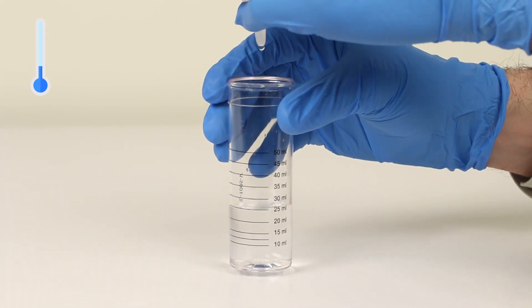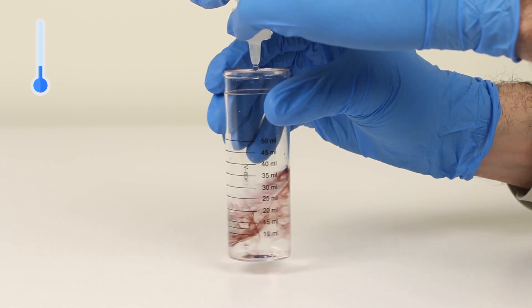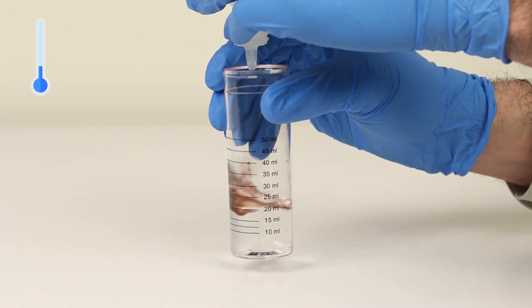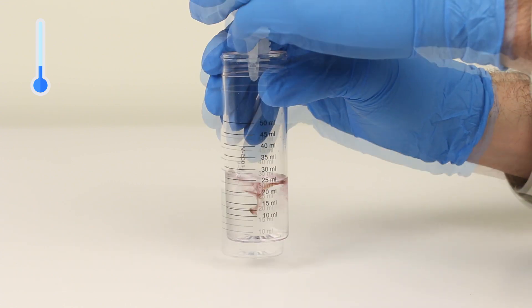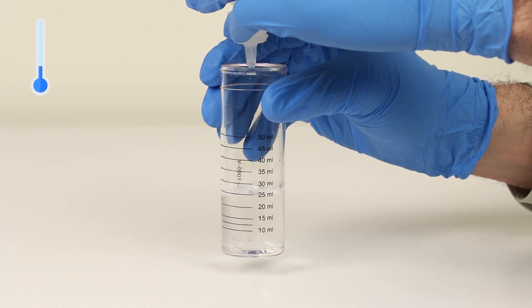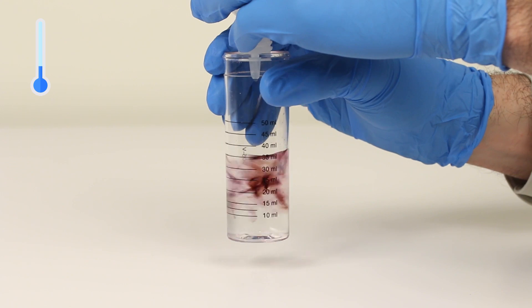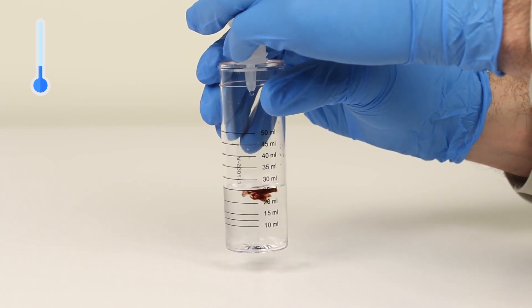The next step is to perform the titration. Add your titrant one drop at a time, swirling the vial after each drop. Be sure to count the number of drops during this step and remember to hold the bottle vertically for a consistent drop size. Continue adding titrant and counting the number of drops until the sample color changes from colorless to blue.